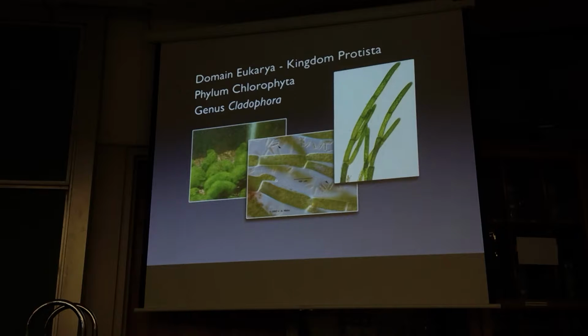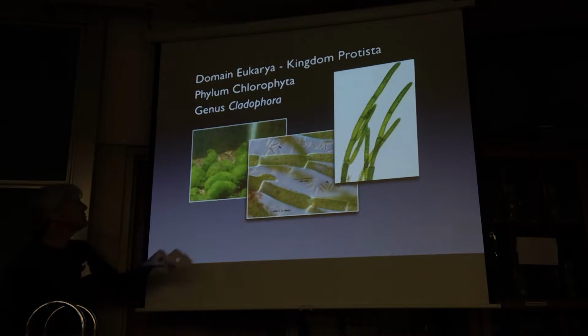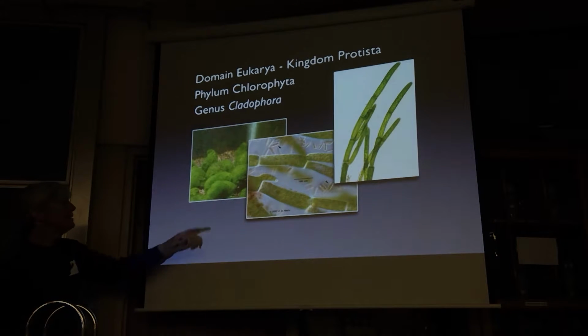And then our last example, this is again a filamentous algae, but it's a branching filament. This is Cladophora. And the Cladophora cells are quite large, probably even 10x is more magnification than you need to see Cladophora. You're going to see these best if you use the 4x objective. So they are microscopic algae, but they're right on the border of being macroscopic. Here you can see a cluster of these going on the bottom of a fish tank.